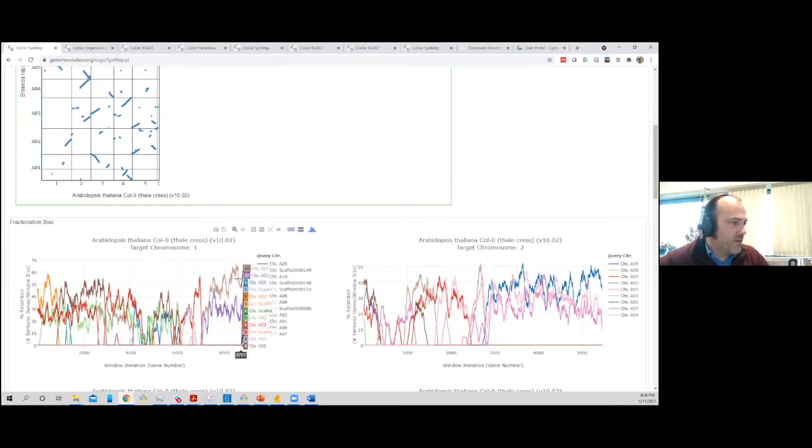You see that here there's really 2 regions that share a lot of similarity to the Arabidopsis chromosome 1. And then you see these interesting inversions where we were comparing chromosome 7 and 2 of Brassica, but then you have this weird little bloop where now chromosome 9 from Brassica has that information that's homologous to chromosome 1.